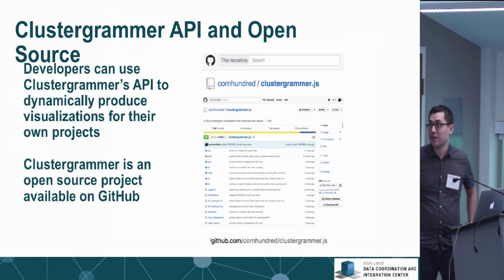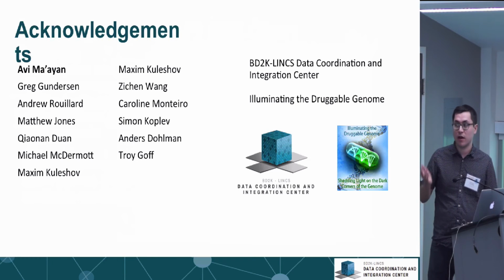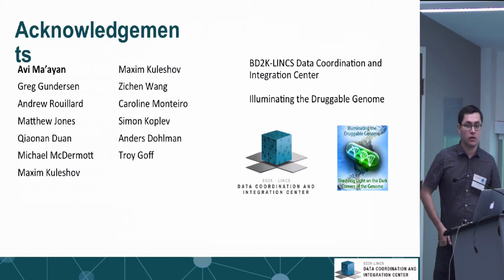And also, yeah, just like to acknowledge the Ma'ayan lab, especially Greg, who helped out a lot with the development of the code, and a lot of the.